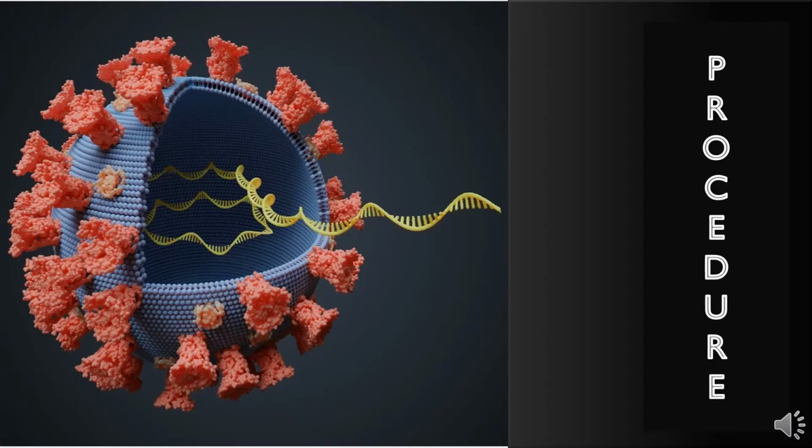Now we start with the procedure. When we receive the kit, make sure to store all the perishables in the refrigerator or freezer as advised in the kit manual. We will prepare enough bacteria transformation mix tubes to do 4 CRISPR experiments. When we come to transformation and CRISPR steps, you will test the CRISPR reaction with and without the DNA template. We will do each reaction in duplicate to make sure our results are reproducible.